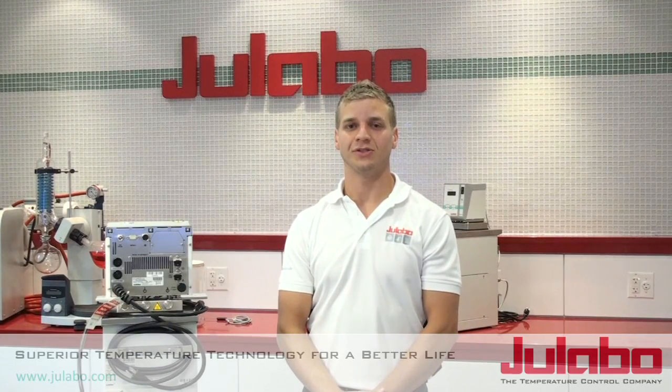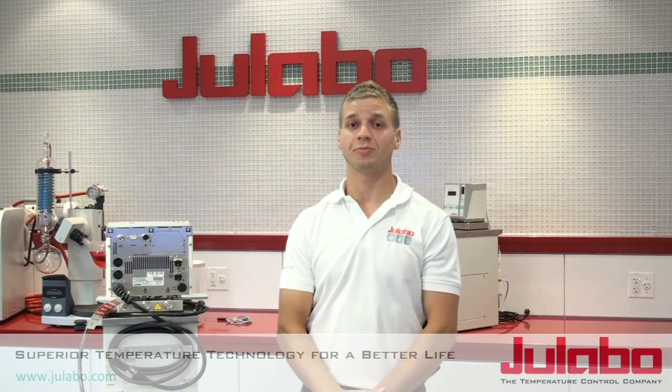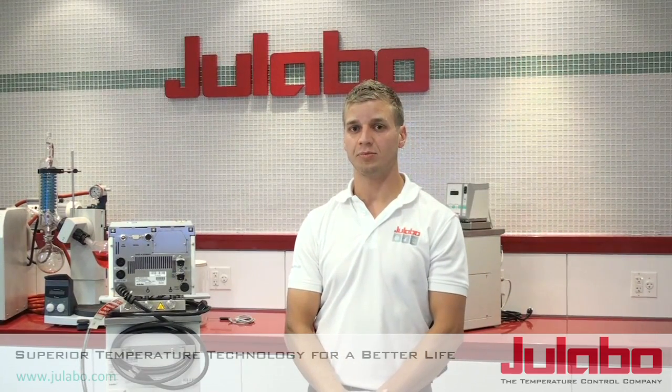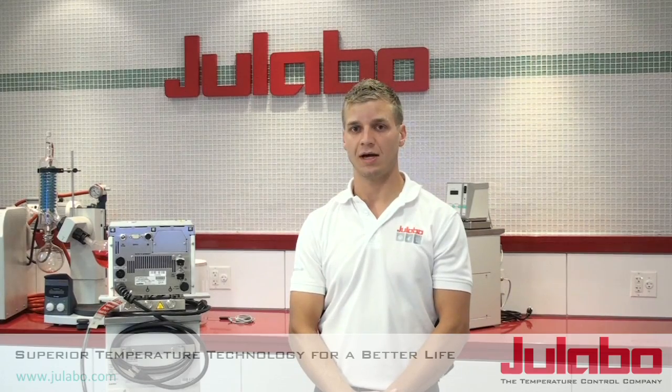Hi, I'm Steve with JULABO USA. First let me congratulate you on your purchase of your new JULABO liquid temperature control device. Today I'll be showing you how to install and set up your liquid temperature controller from JULABO.